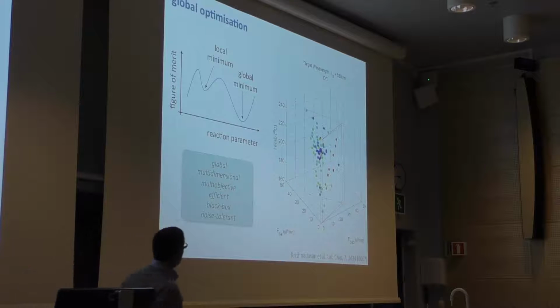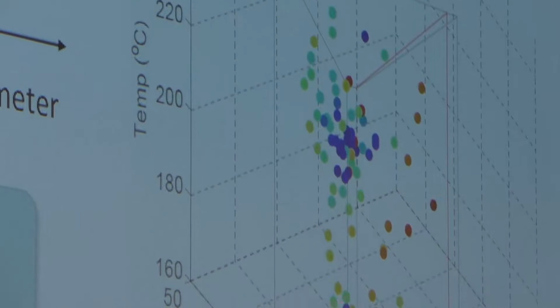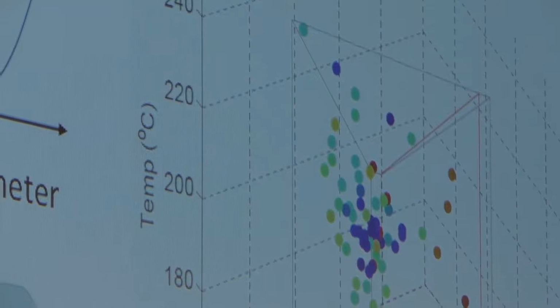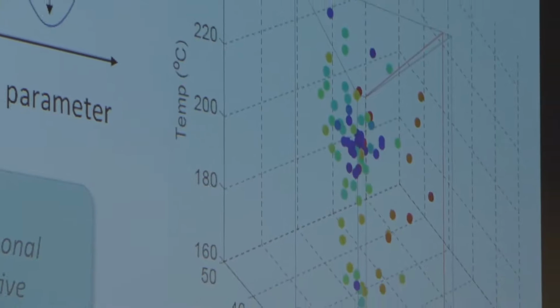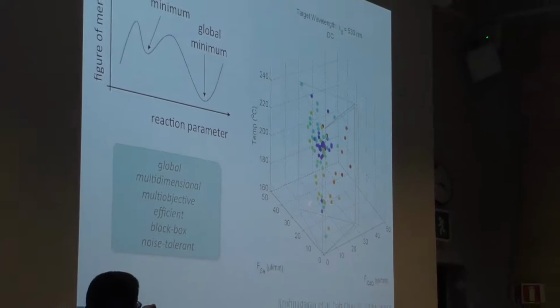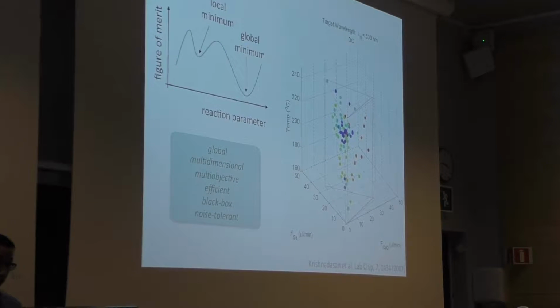So what our optimization routine is trying to do is minimize the value of that fitness parameter. And so you can see a cluster of blue points here. The color bar has somehow left this diagram, but blue is lower. So you can see there's a cluster of points here of low values. But you can also see that there are some lower values down here. So that immediately tells you that we're dealing with a system with multiple optima. And that indicates why it's so important to look at a global optimization routine. The lowest values are found in this cluster here, but a local optimizer might well get trapped over here where the values are small, but not the very smallest they could be.